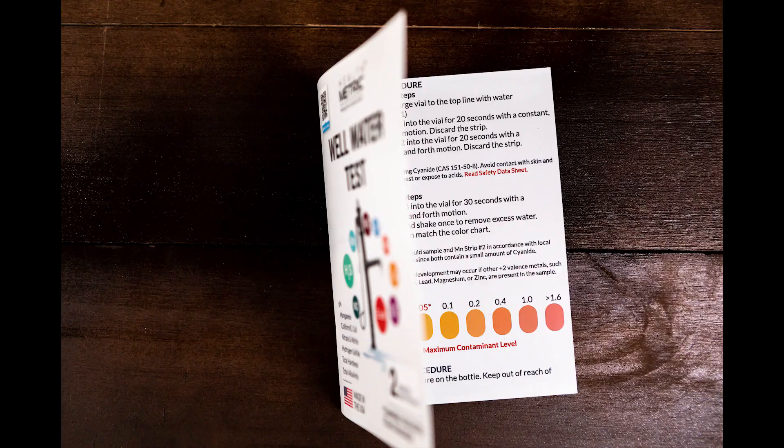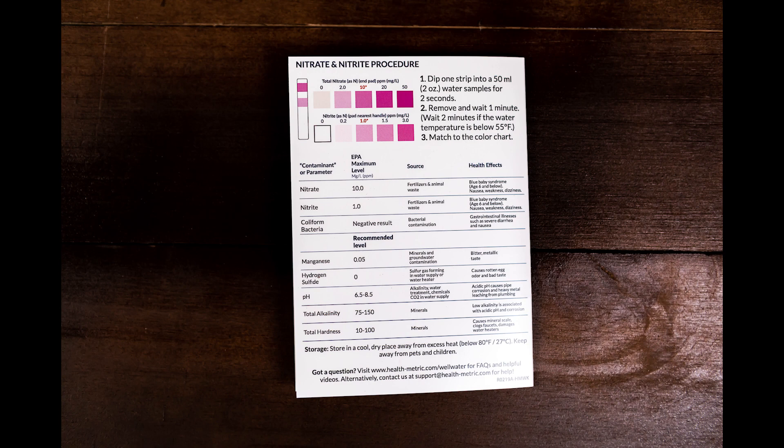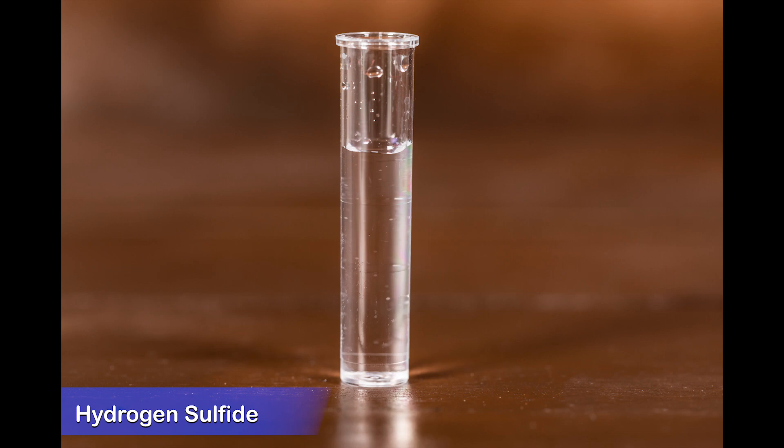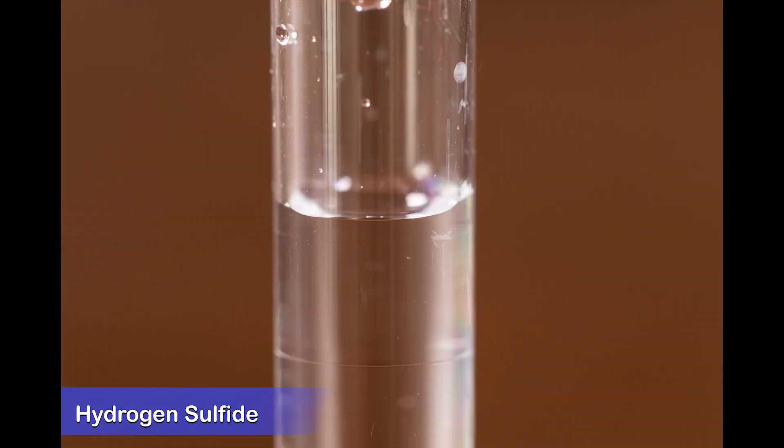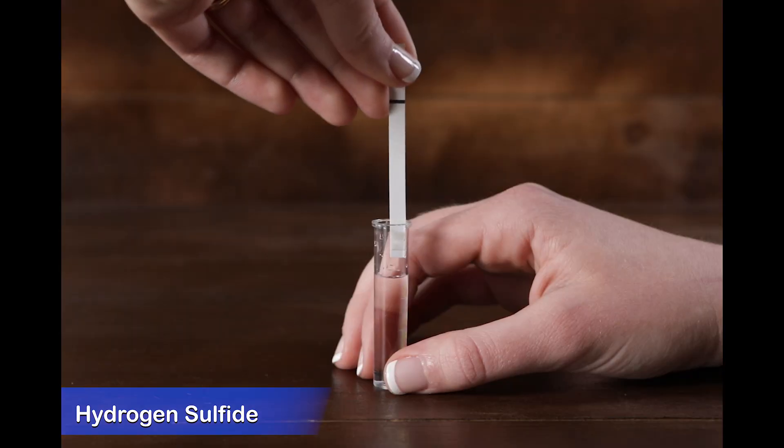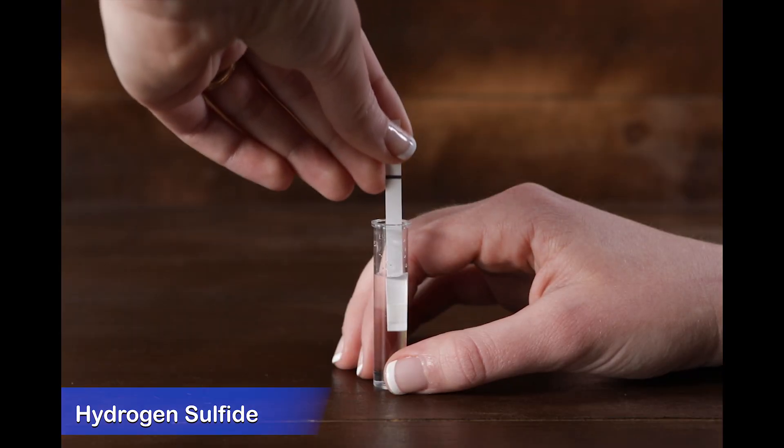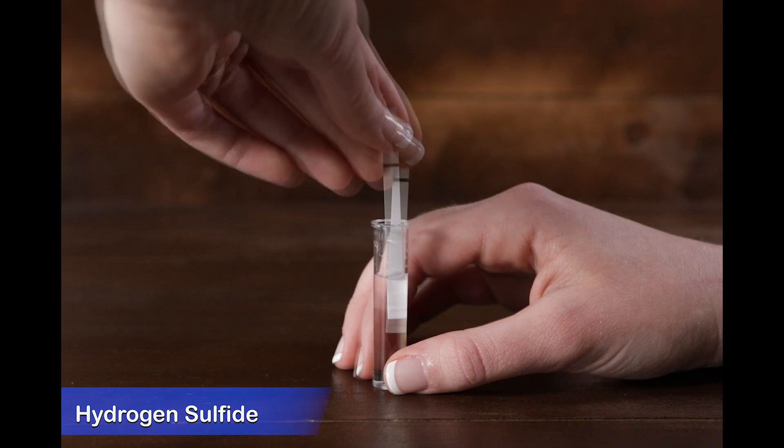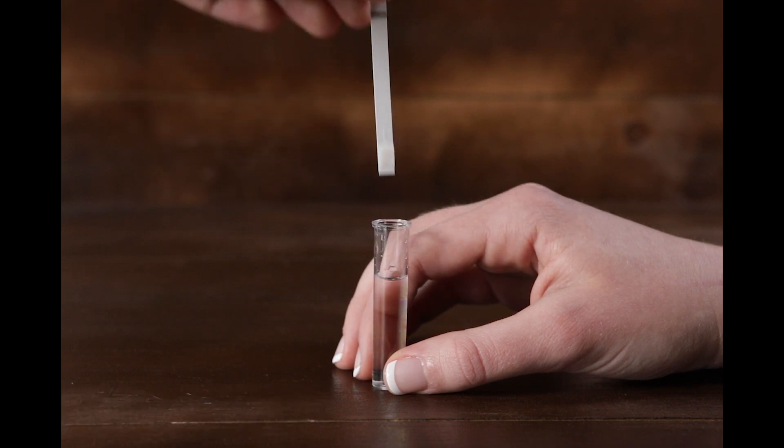The testing guide provides step-by-step instructions for using the kit. The hydrogen sulfide test uses the small clear vial. Fill the vial to the top line with water. Dip the strip into the vial for 20 seconds using a steady up and down motion. Remove and discard the strip.